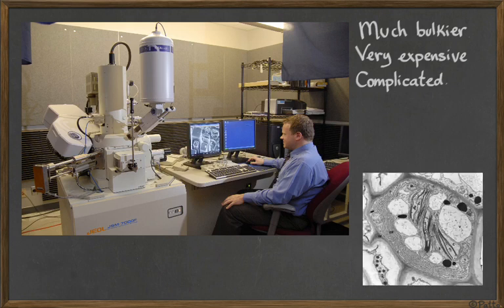They are also kind of complicated to use. Usually in universities or other research centers, there is a technician whose job is entirely to prepare and make the images that are asked for by the researchers and the doctors and so on. So you need a technician just to work the microscope. While the optical microscope, you put on the top of your desk and you can use it yourself. Very easy. You are going to use optical microscopes in our classes here.